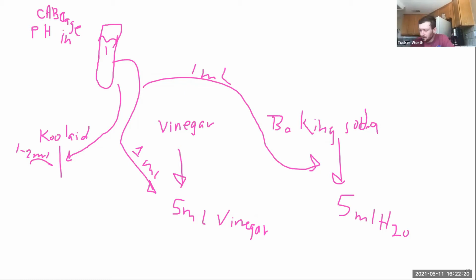Yeah, for all 3, like for the vinegar and the... It's not doing anything. It's both the exact same pretty much. It's like a 4. Okay, so there's something wrong with that solution, and so that means I have to dump it out. I got 3 on all mine basically. Okay, well, mine is just full.